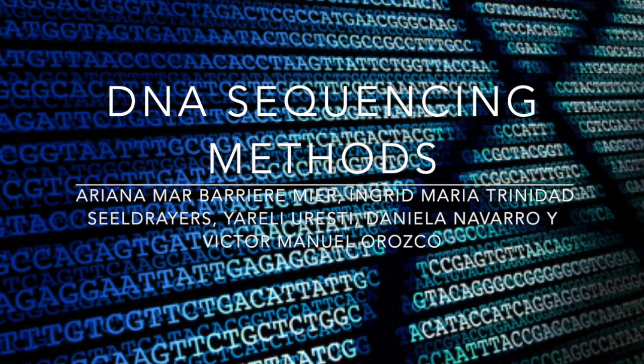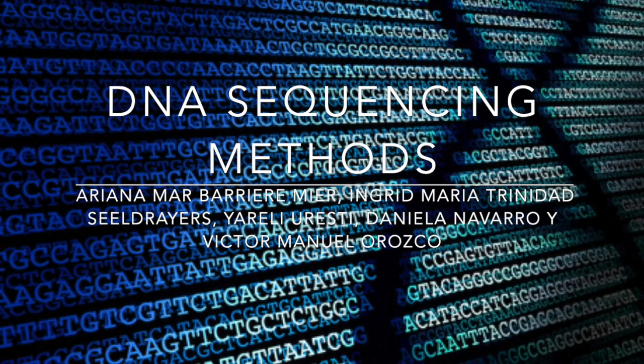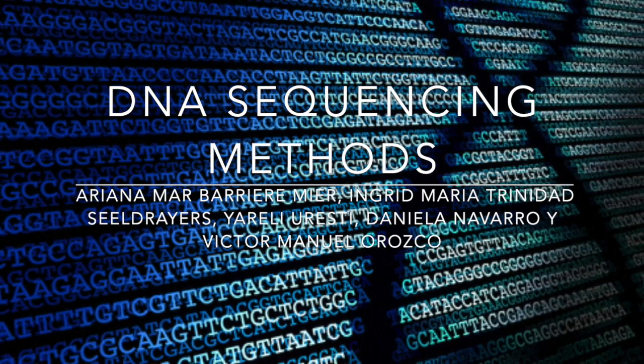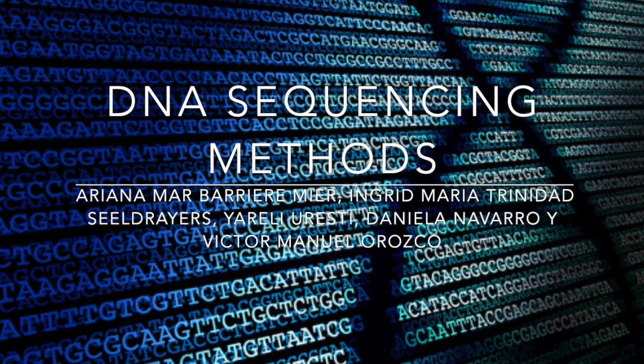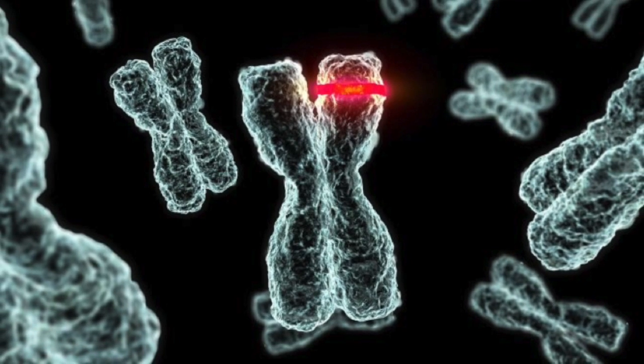DNA sequencing enables us to perform an analysis of DNA because it provides the basic information of the sequence of nucleotides. Knowing this, we can locate regulatory and gene sequences, make comparisons between homologous genes across species, and identify mutations. From this data, in 1974, two methods were independently developed for DNA sequencing.